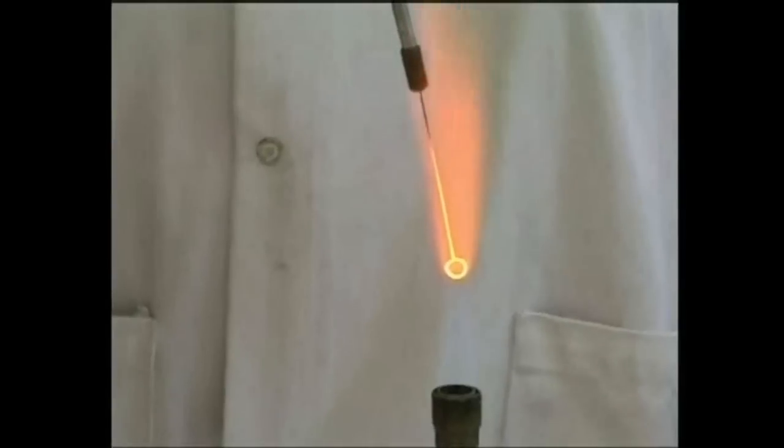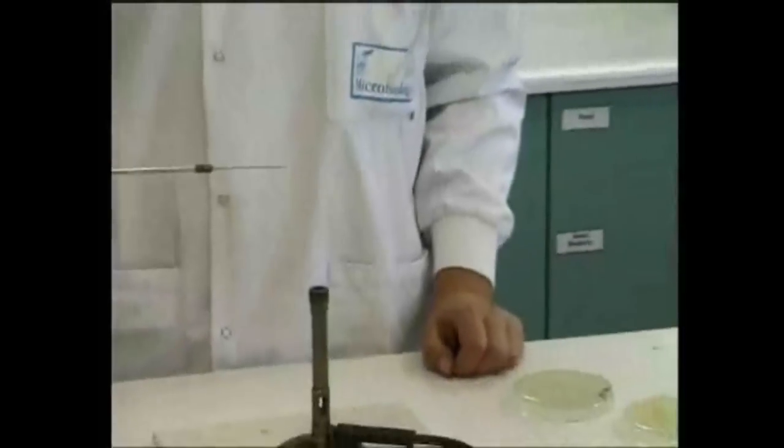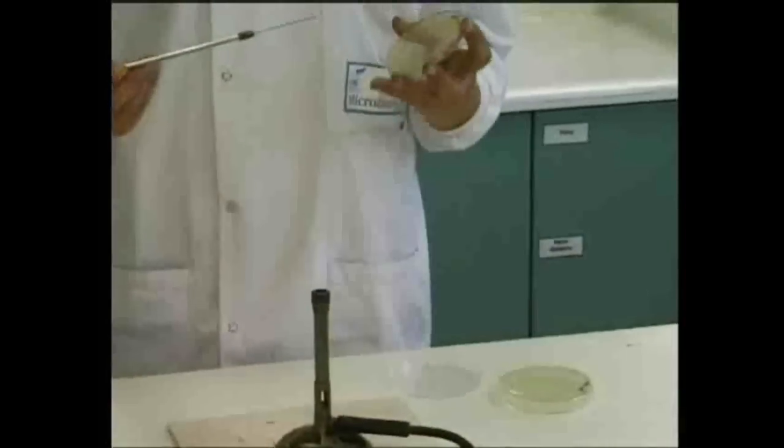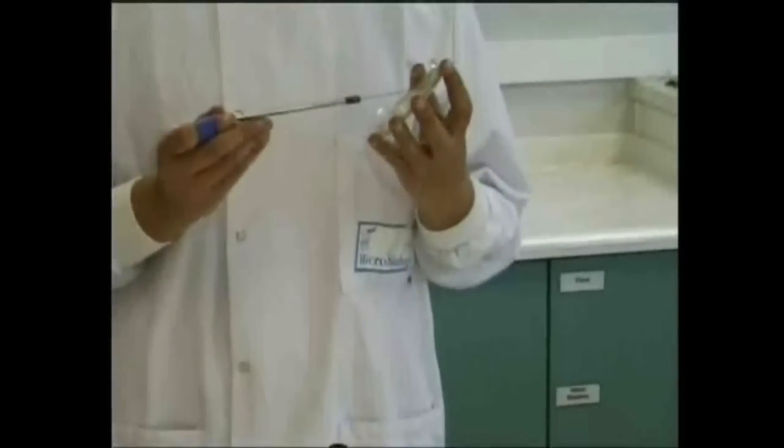Loops and wires are flamed by heating them in the Bunsen flame until they glow red. Hold the loop or wire almost vertically pointing downwards in the roaring flame so that its whole length is heated, and then allow it to cool before touching any cultures.